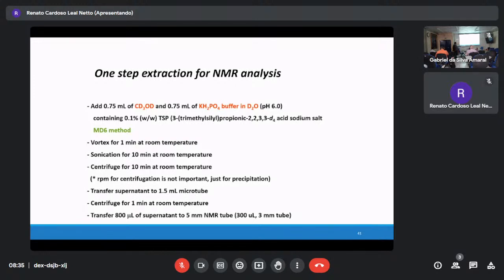After that, now here, 0.7 or something like that. More or less nowadays, if you are using a cryoprobe, how much plant material do you need? More or less 10 to 30 milligrams dry weight is very fine, and 50 milligrams is a really small amount. But what's the problem of this? Always, if you have a protocol, you have to think about what the problem is. That is really important.